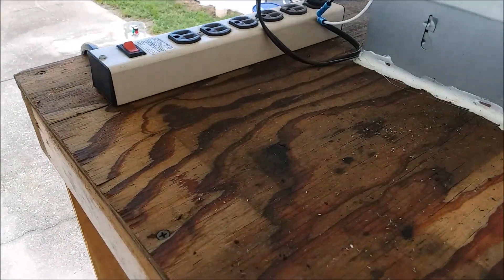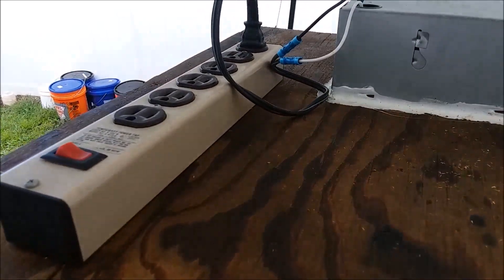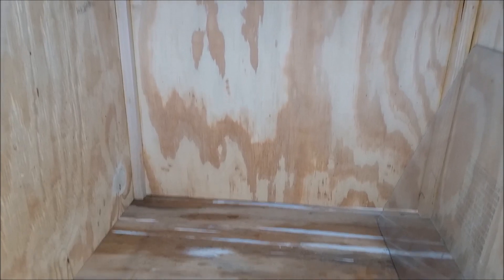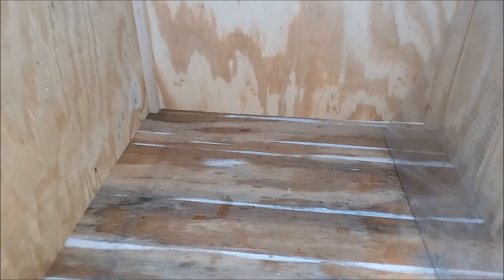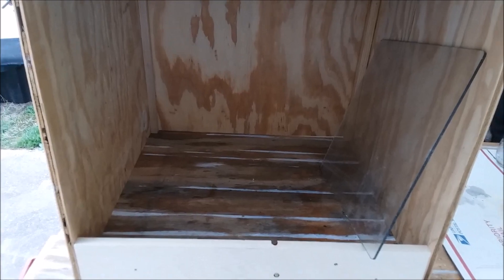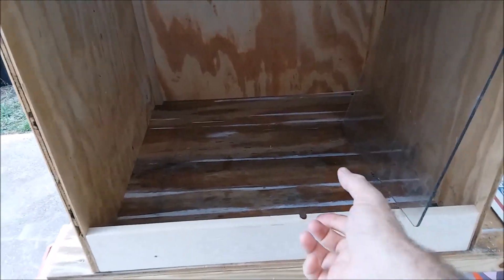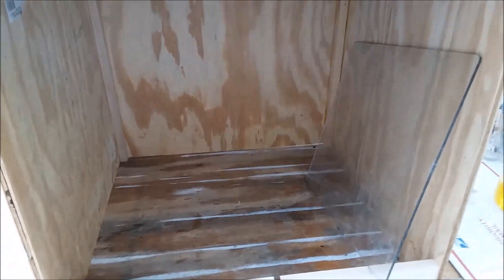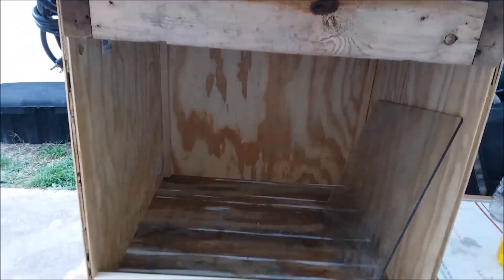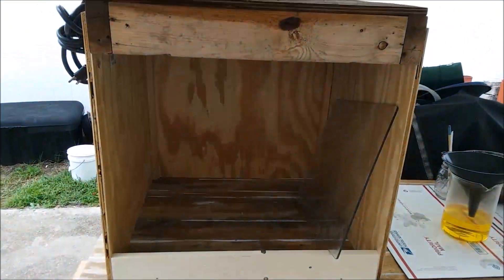I've got an outlet strip mounted up here. Right now only the vent fan's plugged into it, but I'm going to put some holes up here to run the cords through for hot plates and lights. There's going to have to be lights inside here because it'll be a little dark, and the hot plates will need power. I've got a piece of plexiglass but it's not the right size for doors, so I'm going to have a couple pieces cut to size and hinge them so there'll be a door on either side that opens out, with a little air gap underneath for airflow even with the doors closed.